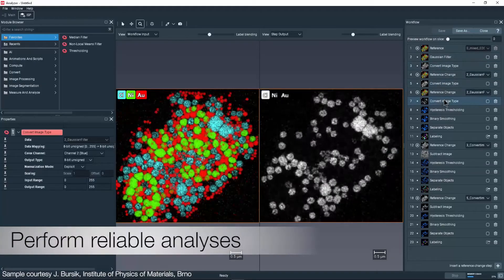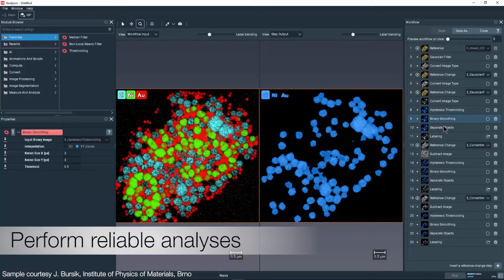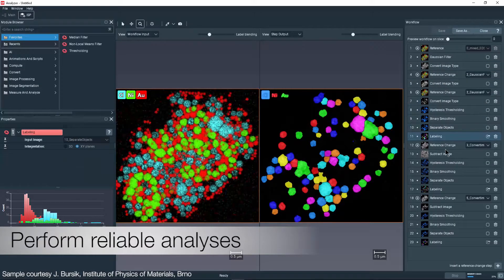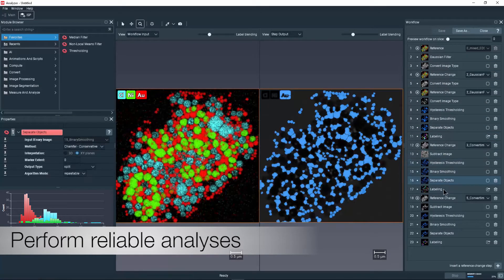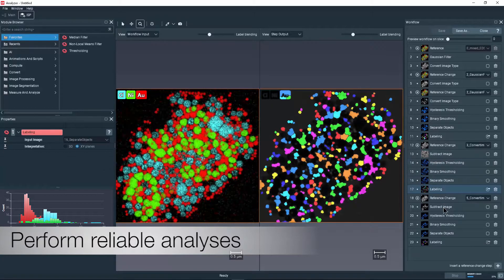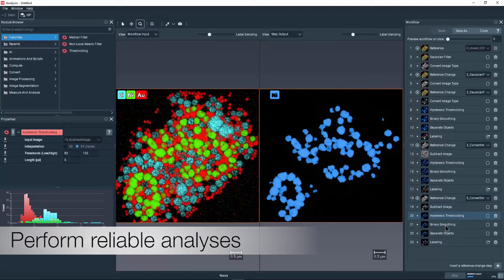The recipe-based approach of Aviso2D software ensures that the performed analyses are reliable and independent of any manual processing variability.